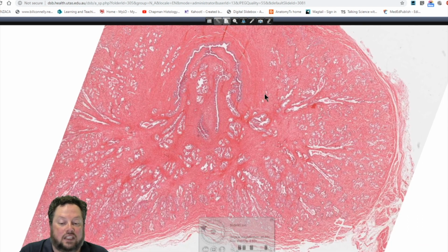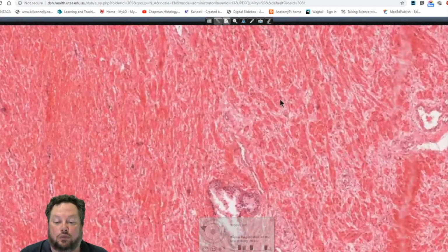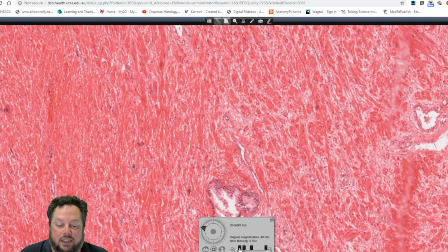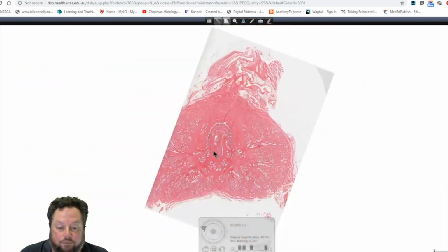So the prostate gland is extremely acidophilic. So look for that if you get a section, for example, in our practical or our applied exam, look for how acidophilic it is. That's because the stroma of the prostate gland has lots of smooth muscle and dense connective tissue, both of which are protein, both of which are going, of course, to attract the eosin stains. So this is all smooth muscle in the wall of the prostate gland. And of course, that's under sympathetic control as well during ejaculation.